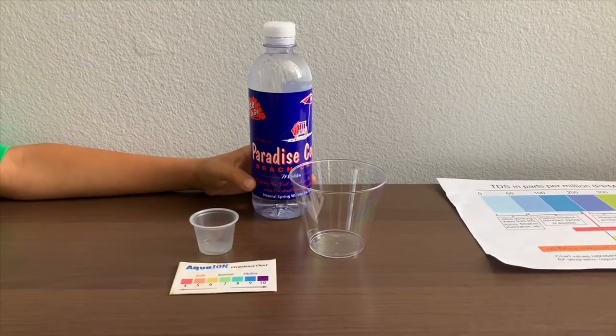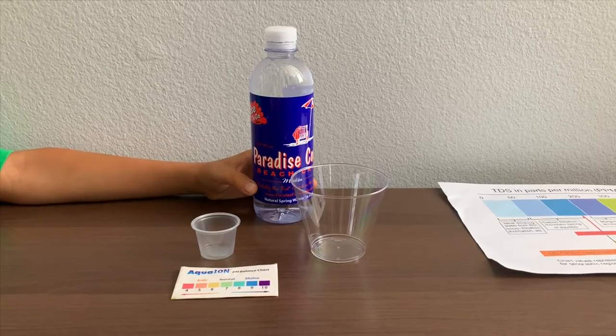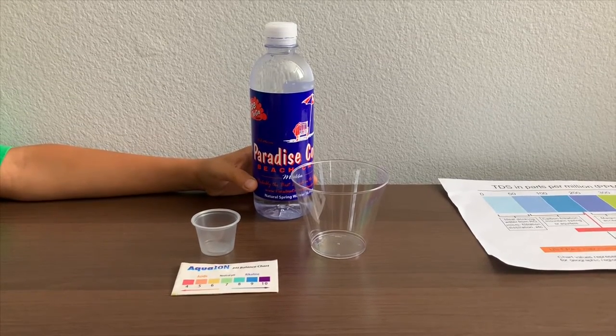This is Paradise Cove Beach Cafe Natural Spring Water, sourced from Mountain Palomar, California. Let's test the pH and TDS levels.